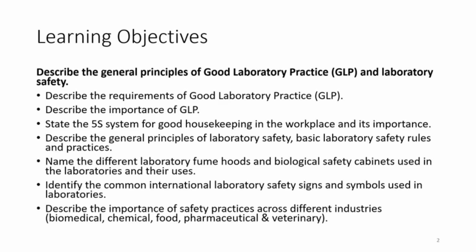You should be able to identify the common laboratory safety signs and symbols. And lastly, you should also be able to describe the importance of safety practices across the different industries.